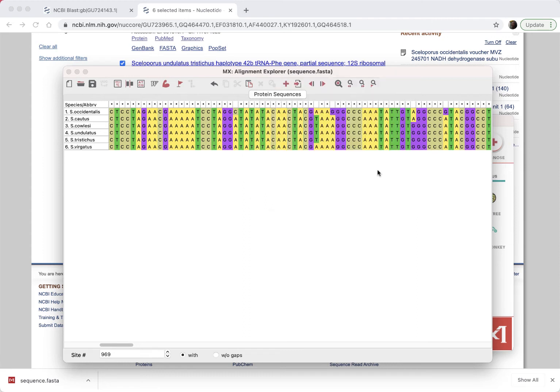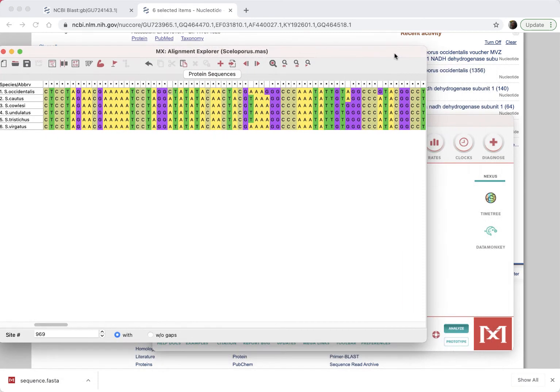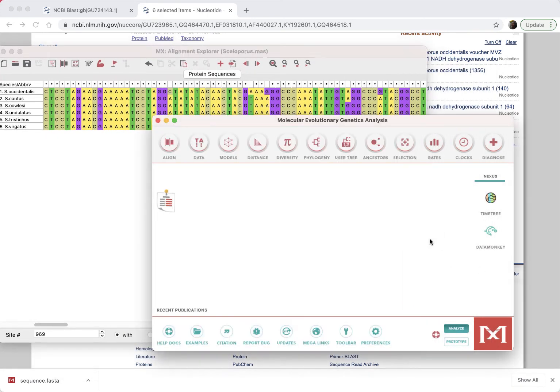The downloads. Okay. So there you go. And now this sequence of completely aligned information is there in my folder. Now I can go back to the other window. You can see the other window over here, right? So click on the other window, bring that up.